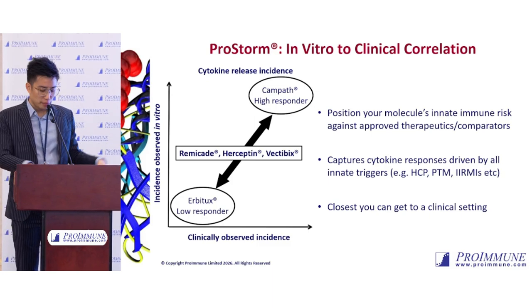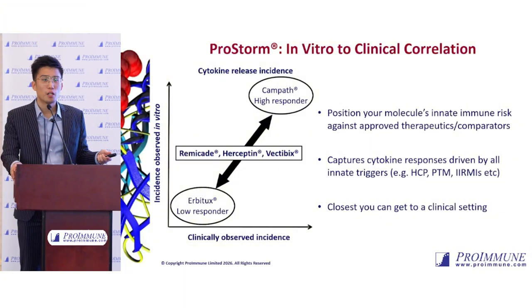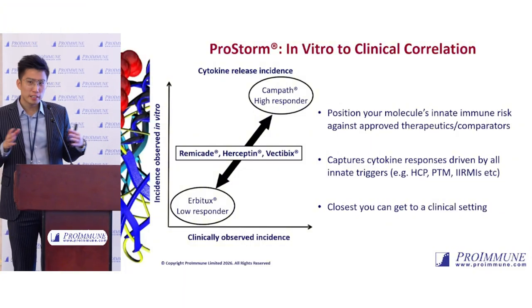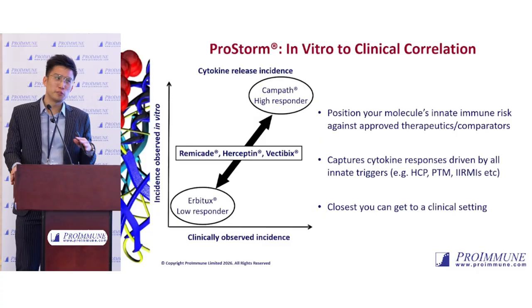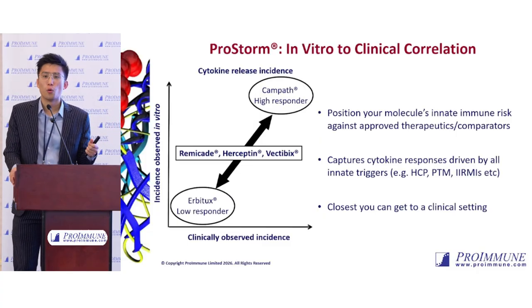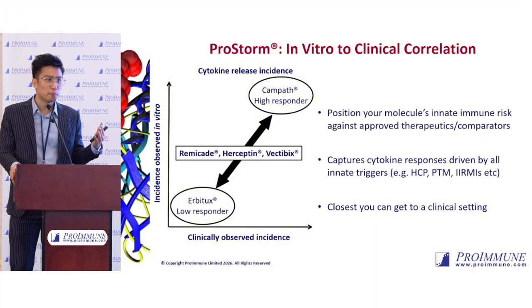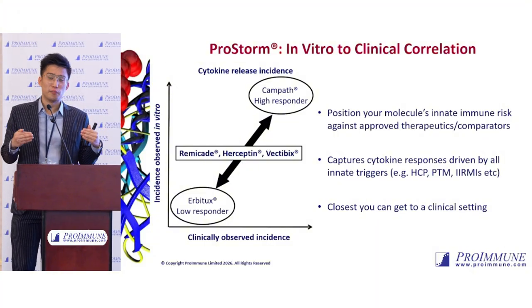And here, it's also quite important to note that this is a comparative analysis. What I mean by that is that if you just test one test article, in this case, and you see maybe 100 picograms per ml for your IL-6 response, what does it mean? It means nothing, right? You need to have a comparator. You need to have something to benchmark against to make that result meaningful.